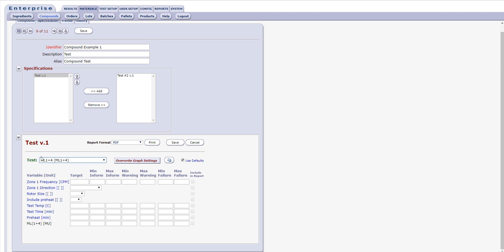The functionality here is identical to that of the Specification Editor's Criteria tab. This allows you to make changes to the specification from within the compound function.